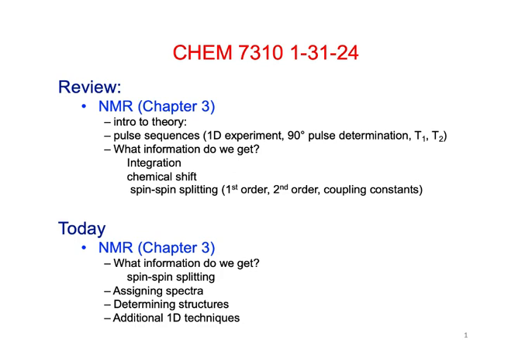And then we are going to start looking at some spectra. So we'll work through at least one where one step sometimes is not really trying to propose a structure, but just assigning the spectrum, the peaks, to a molecule. We'll go through a few kind of easier examples.